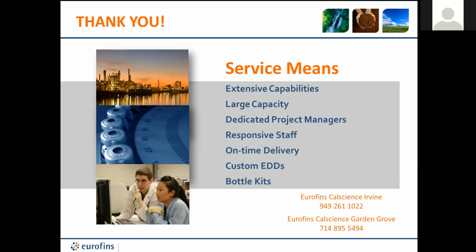And this is John Charauskas. I know the Water Board and even the US EPA has made a big deal about no intermediate containers for oil and grease and VOCs, but especially oil and grease and the IGP. I've heard consultants talk about actually submitting the analytical container as a part of the collection device, I should say, as a part of that sampling. Have you heard of anything like that, or where they're actually doing maybe a smear or a wipe sample on the collection device? Have you heard anything like that?